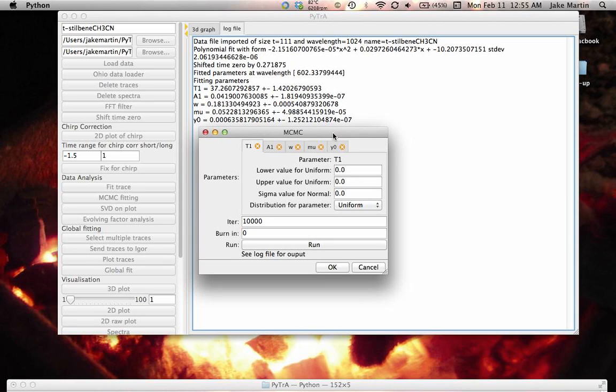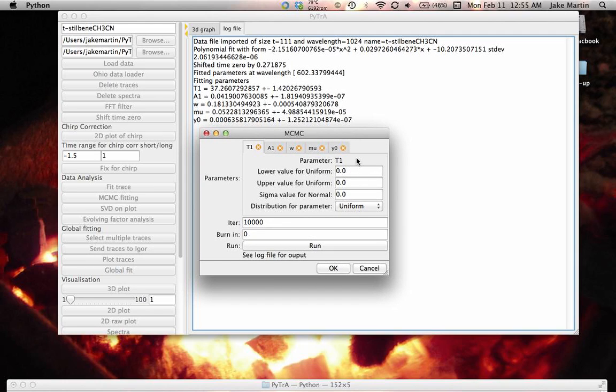But if not, then there's a random number that says there is a probability that it will still take on that new value. So that means we can span a lot more parameter space and work out what the most likely, or the most probable, solution is. So there's no unique parameter value.